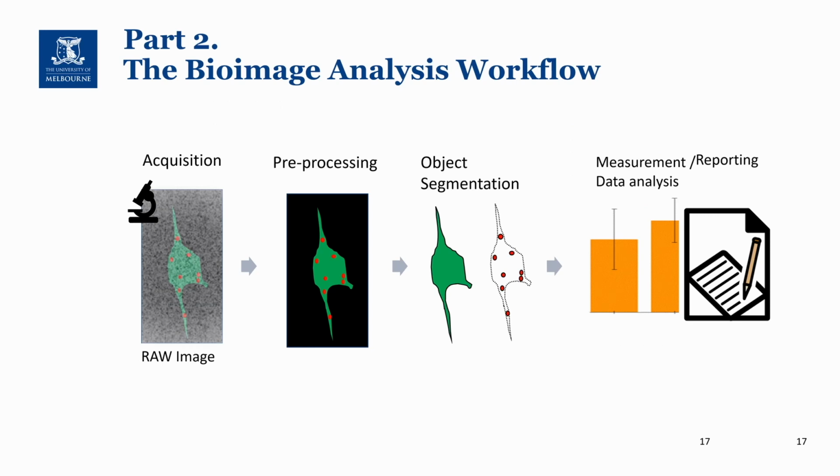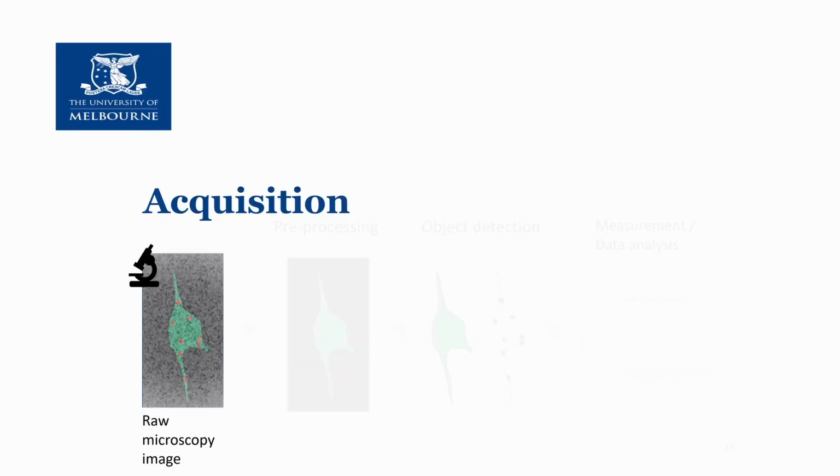Let's move on to the main part of the talk and discuss the bioimage analysis workflow, starting with the basic rules to follow when acquiring images.